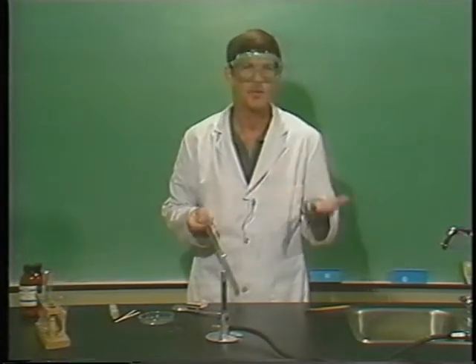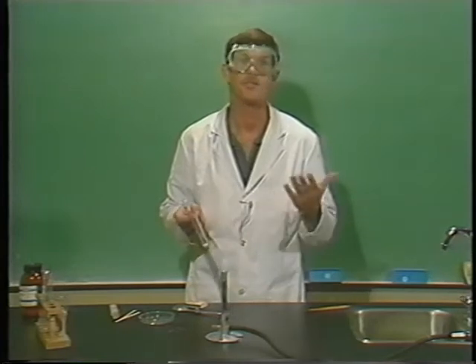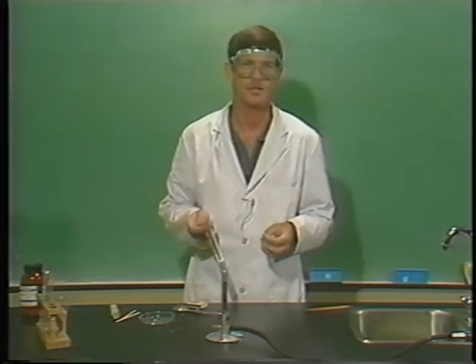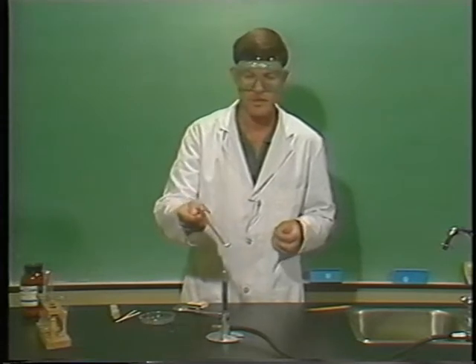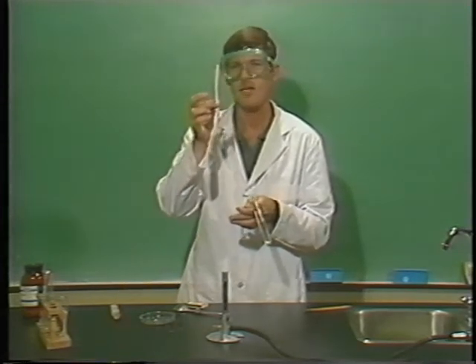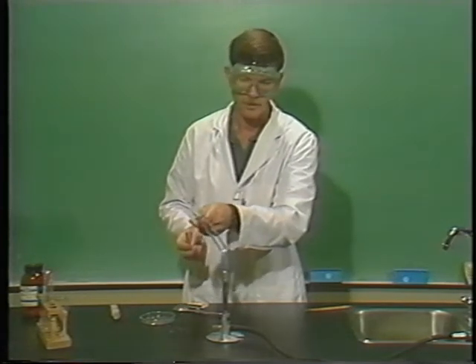Now let's say that there's one guy in the back of the class who always likes to do unauthorized experiments. He's a troublemaker. We'll say his name's Mike. Seems for some reason Mikes are always getting in trouble. So he's going to heat this chemical gently, moving it in and out of the flame until it just melts, and then he's going to sneak something else in the test tube, something organic. These two little pieces of wood splint. Well, let's see what happens when he does this.